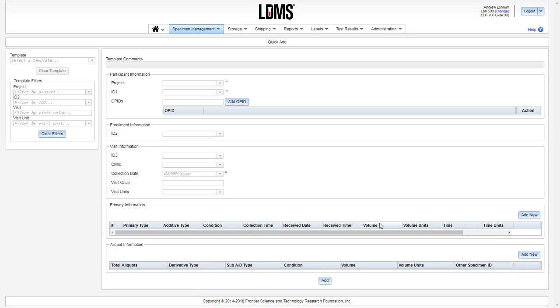A template is set up by the lab data manager on your study in conjunction with a laboratory technologist. It is based off the laboratory processing chart and will contain all expected specimens collected at that visit. Further documentation on what template to select is available in your lab processing chart.